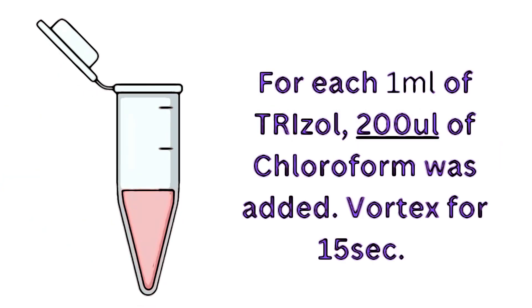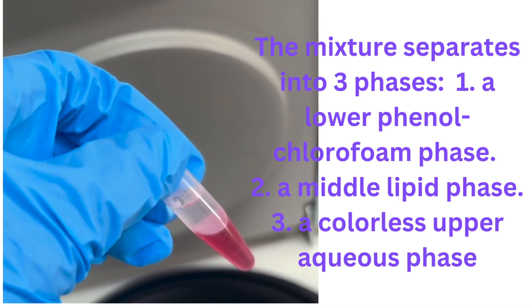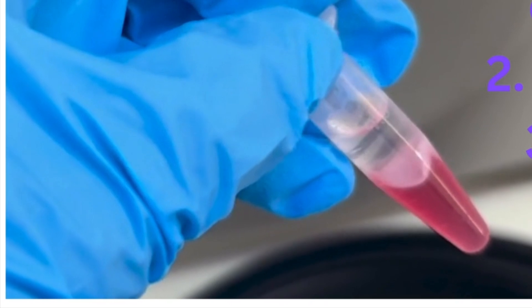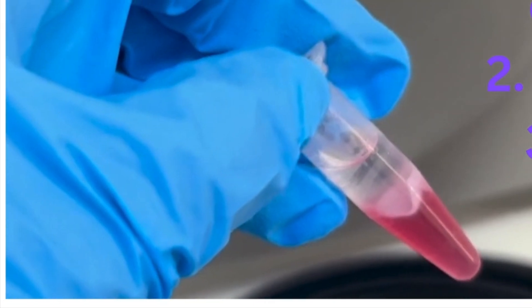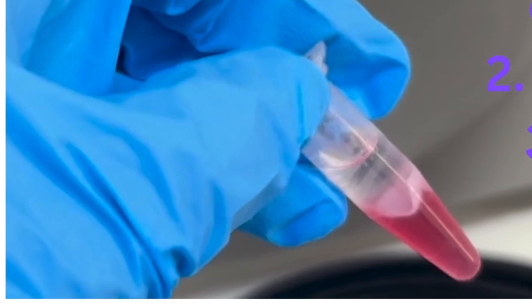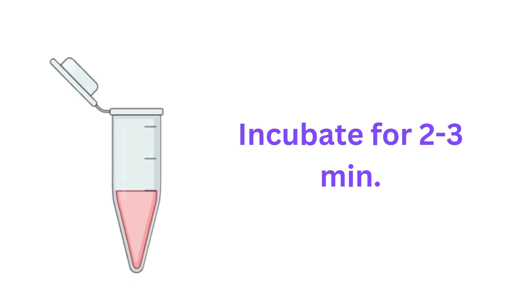Once you've homogenized, you're going to add chloroform. For every milliliter of TRIzol, you want to add 200 microliters of chloroform, and vortex for about 15 seconds to make sure it's fully suspended. The chloroform is what allows the phase separation — it separates your proteins and lipids away from the RNA and DNA. The chloroform is added and then centrifuged to obtain three distinct layers. After adding the chloroform, wait two to three minutes to let it incubate in the sample.